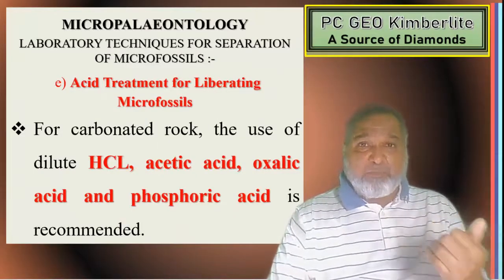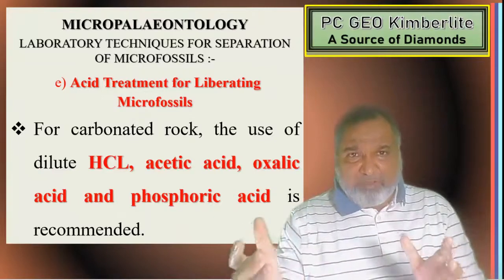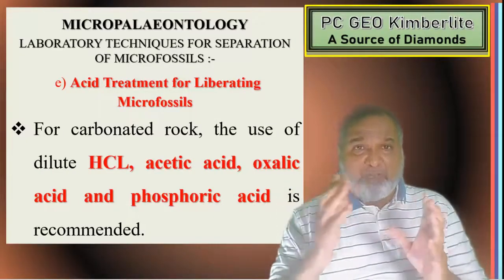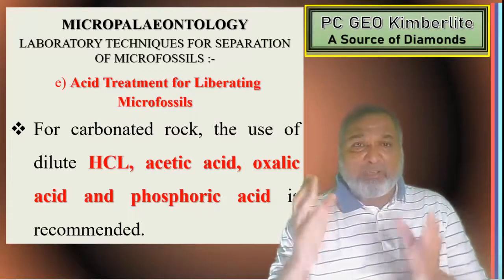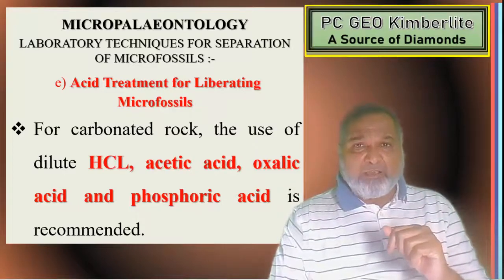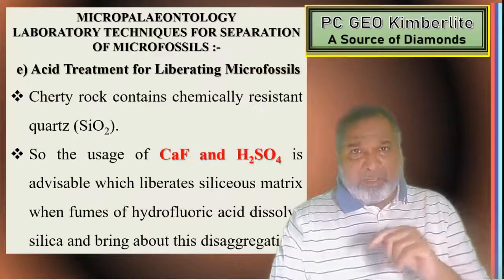Acid treatment for liberating microfossils from carbonate rocks. Yes, that is very important. The use of dilute HCl, acetic acid, oxalic acid, or phosphoric acid is recommended for the carbonate rocks.